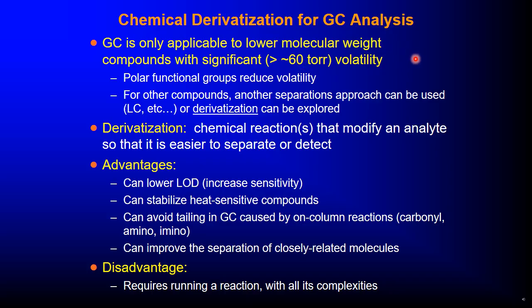Polar functional groups reduce volatility. For other compounds, another separation approach like liquid chromatography can be used, or derivatization can be explored. Derivatization is a chemical reaction that modifies an analyte so that it is easier to separate or detect.